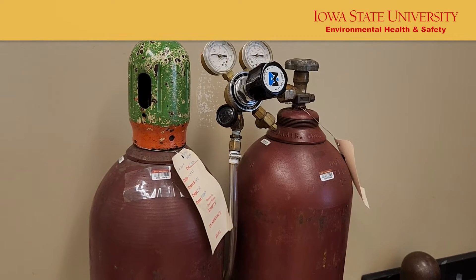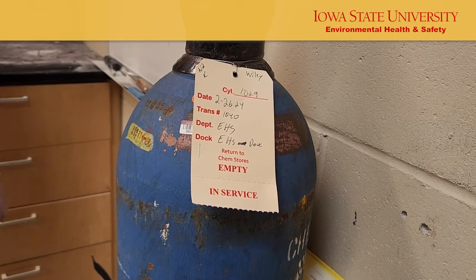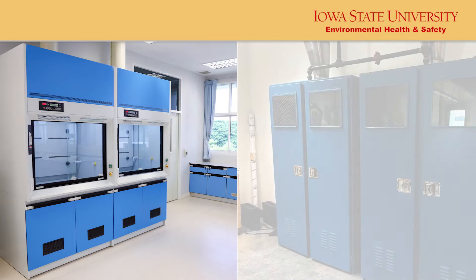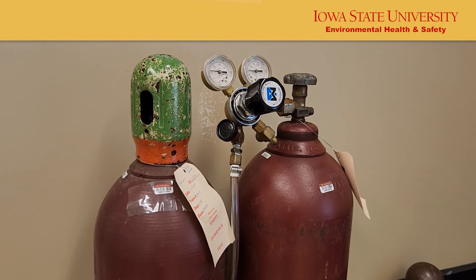Once the regulator is installed, there are no leaks, and the gas supply is connected to your application, the gas is now ready for use. When using flammable or toxic gases, the relief valve should be vented to a fume hood or other ventilation source. To improve the lifespan and accuracy of your regulator, do not keep the regulator pressurized when it is not in use.